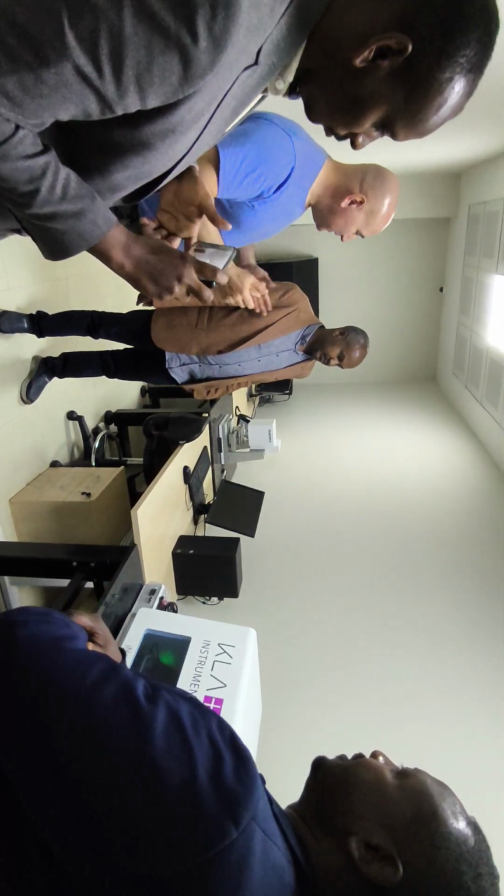This atomic force microscope is also for electronics. There is no need for it for you, it's too sensitive for you. But for research it is necessary, of course.